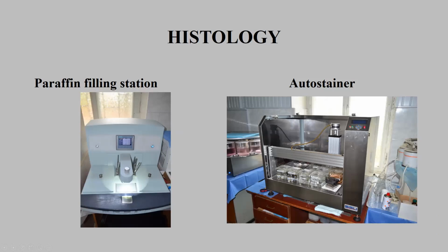It's the opposite process. We start from more concentrated liquids, and it's hydration. It's the process we do before the return of water to the slide, and staining in hematoxylin and eosin. Interesting is this routine staining. It's common for all countries around the world, and all countries use these stains.